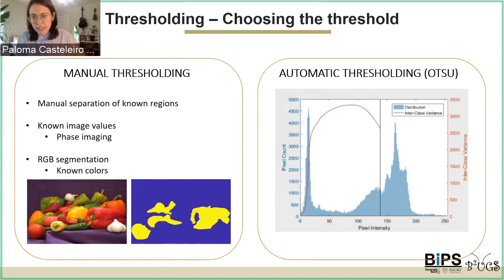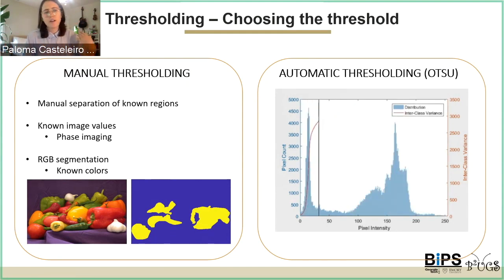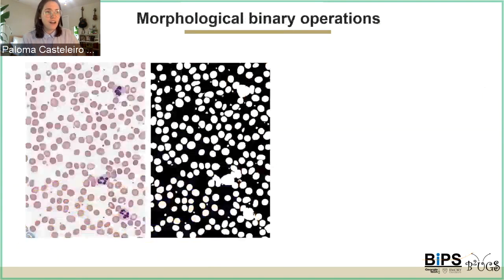This would be the simplest way to threshold, and there are obviously other techniques for non-natural images, but we usually rely on Otsu. There are also multi-thresholding techniques that rely on Otsu, and that means that you can break an image into different steps of thresholds. We are not going to go into that, but just know that those exist and that you can also do that. Now, thresholding is cool, but it's often just not enough, right?